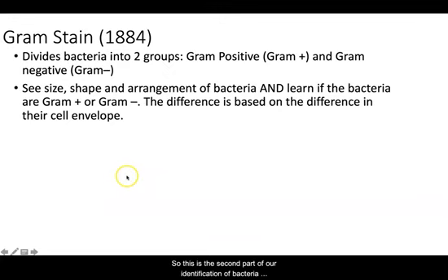So this is the second part of our identification of bacteria lecture, and where the last video left off was just finishing with what a differential versus a simple stain were. And so now we're going to be talking about three different examples of differential stains.